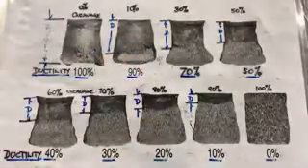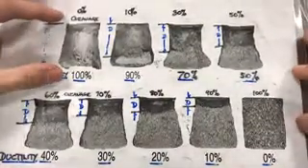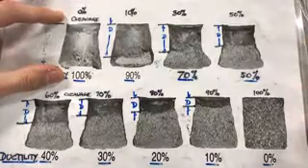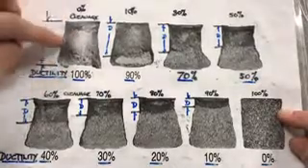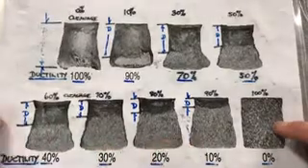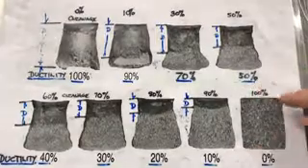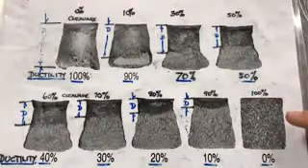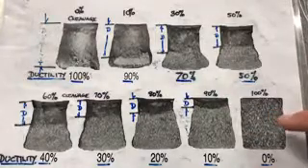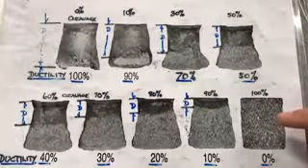So here we have a chart with the two spectrums of how the fracture surface may look like. So this is the beginning and this is the end. So we're going this way here with this particular chart. And as you can see here for this sample, we see no geometrical change of its cross section. So it means that this sample was fractured with 100% cleavage, or in other words, it was brittle.